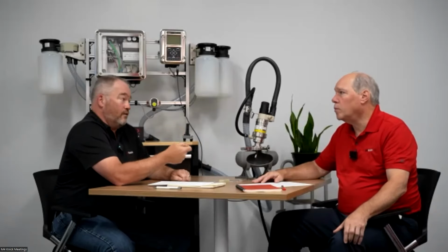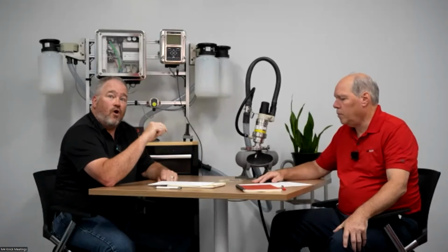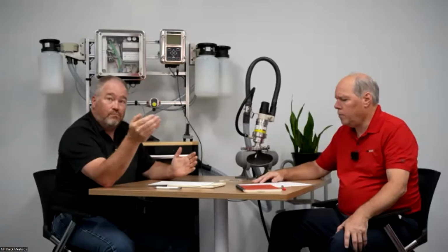Calibrations benefit greatly from automation. And I already said, by getting a more precise calibration, you get a better product quality potentially. Also, by having a better calibration, you reduce the number of interruptions in the process. If you have interlocks that trigger when the pH drifts out of range, you then have to take an action to correct that pH. Well, by having better calibrations that aren't being affected by human error, you can potentially eliminate those trips, deviations, and lockouts, which, again, benefits operational efficiency and cost.